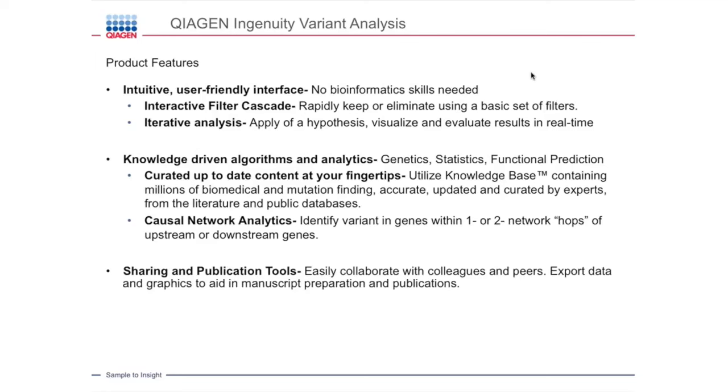This tool is designed for sharing your data and information with others, so you can share it more privately with your colleagues and collaborators within a group, or you can share your analysis more publicly as a supplement to your paper by using our publication tool in the application. In addition, this is designed for scalability, so we're enabling analysis of thousands of genomes and whole exomes simultaneously.